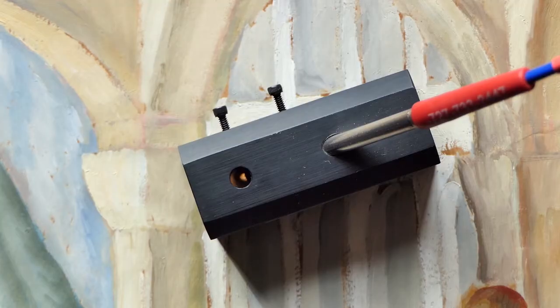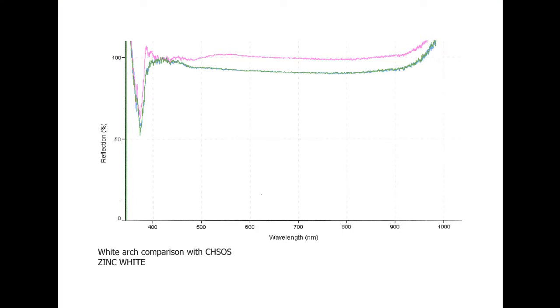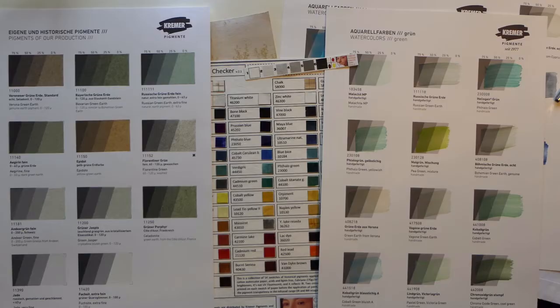So we divert to another white pigment conundrum. If we look at the white area in this work using FORS, we get a distinctive zinc white spectra. And you can see it's a perfect match with the CHSOS example. It would not be unreasonable on this evidence to pronounce the pigment as being zinc white.